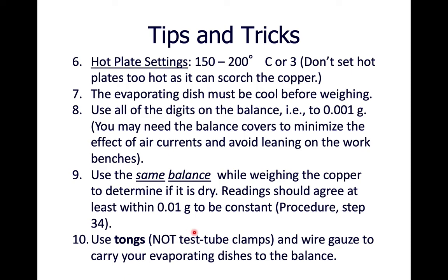All right, all the waste for this lab needs to go into the appropriate waste containers. You need to have your full safety equipment for this lab.